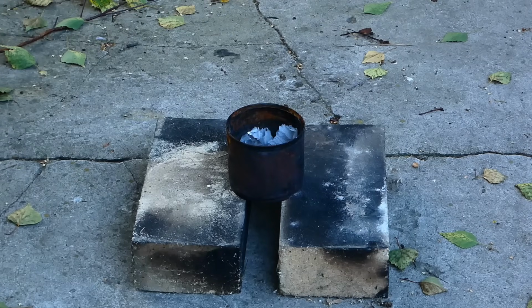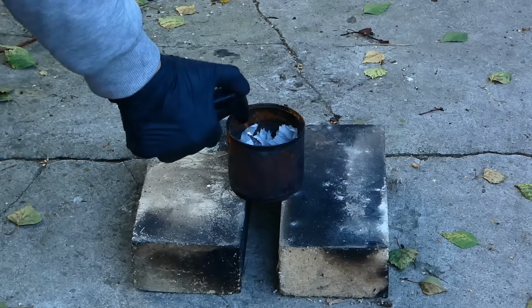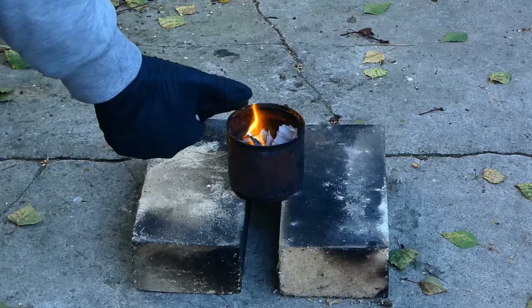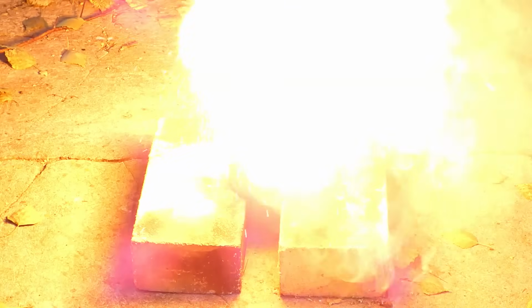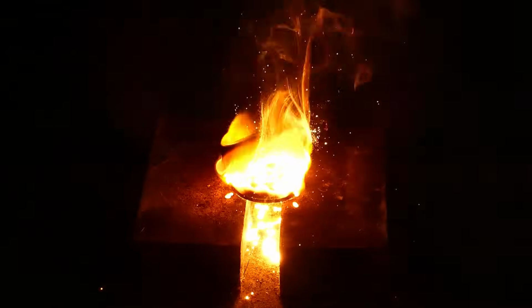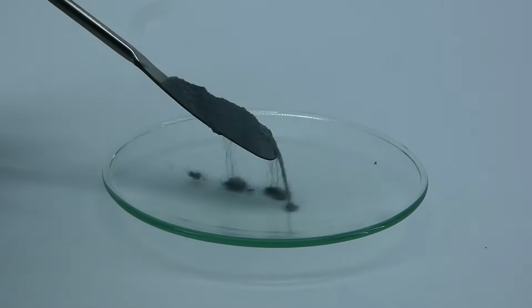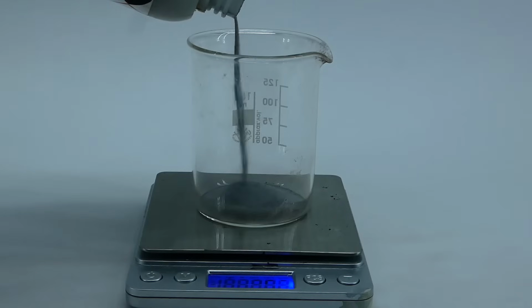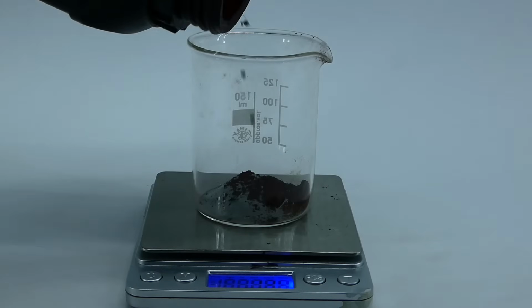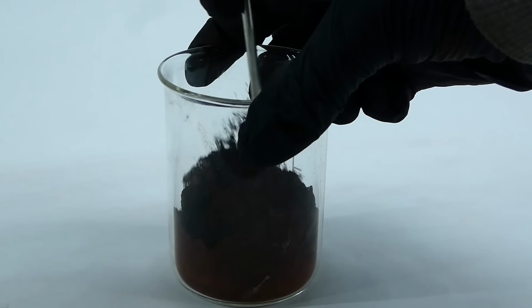I am sure that most of you know what thermite is, but most people only know about the most basic and widely used thermite, which is the iron oxide and aluminum thermite. It is prepared by weighing out stoichiometric amounts of iron oxide and aluminum powders and mixing them very thoroughly. Here I make some of it by mixing 7 grams of aluminum powder with 20 grams of iron oxide powder and placing this mix into this contraption.